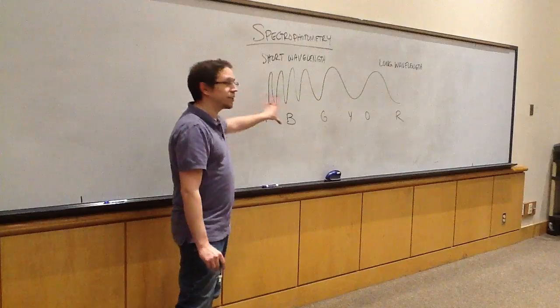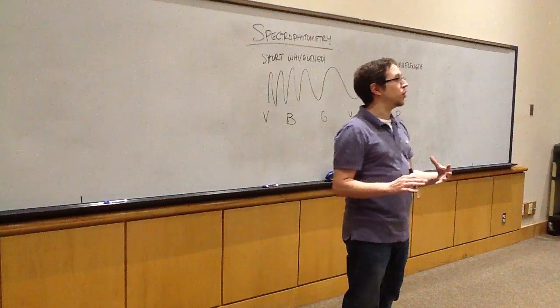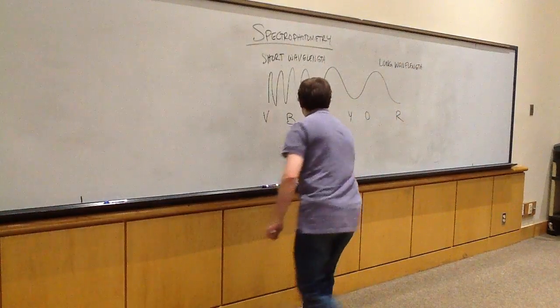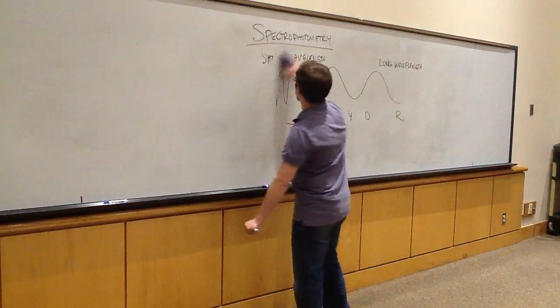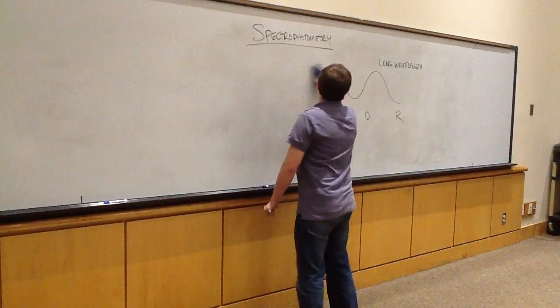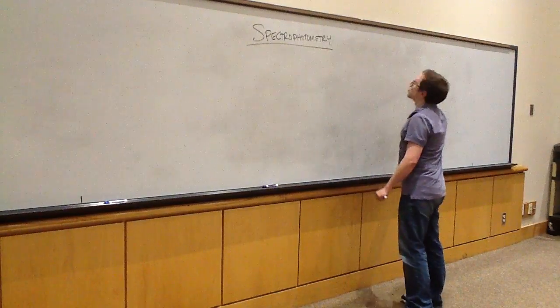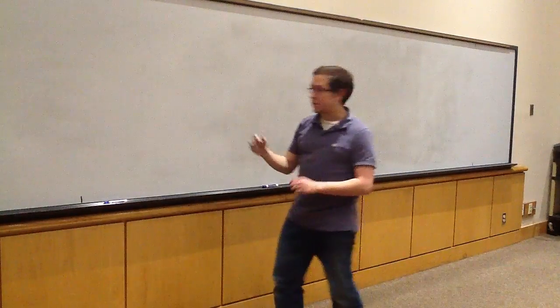Now, outside of this, we weren't just doing this in the chapter. We also were looking at the ability of the spectrophotometer as a device to measure the concentration of an unknown solution. All right, so let's go ahead and talk about that real quick. We're going to talk real quick about the spectrophotometer.